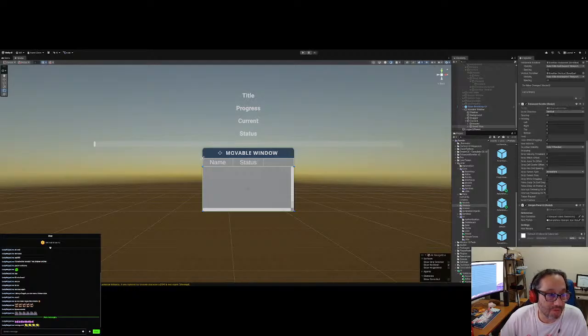We grab this, we authenticate again, we make sure they're logged in, and then we have the response. Here goes the login service, then the patient service, then a module, and here goes the database service. That's what we're using. That's our CRUD service. I'm calling it the CRUD service because I can't pronounce that.